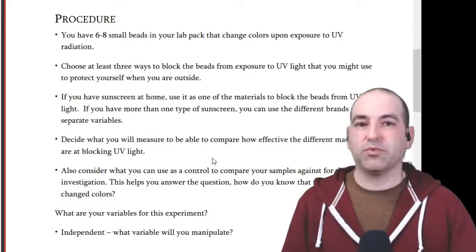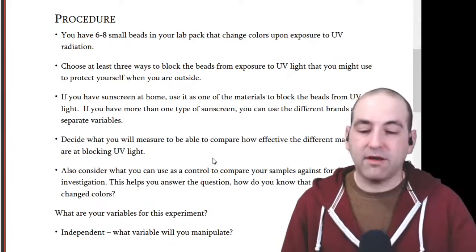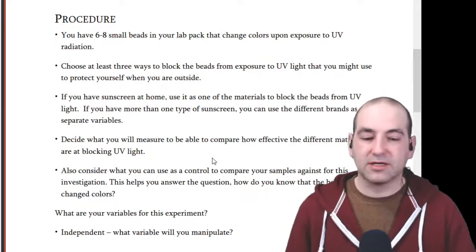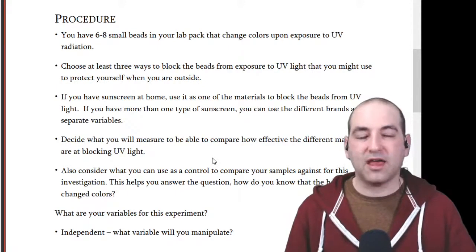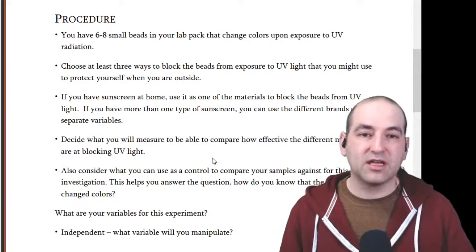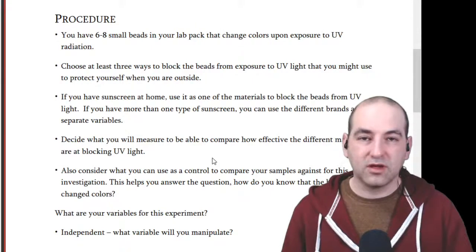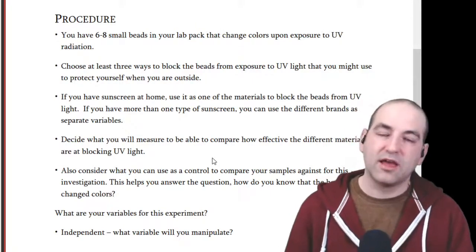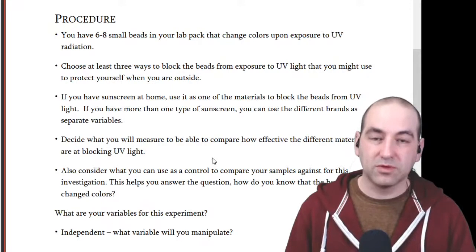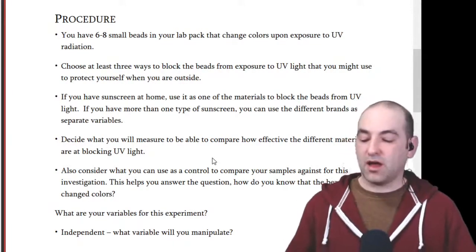You can look at different brands of sunscreen, whatever. But the idea is that you set up this full experiment starting from just this basic idea of can you block UV light from getting to the beads, and then eventually getting to a really good procedure where you've clearly shown the differences and you're able to reproducibly get those results. And you know what?